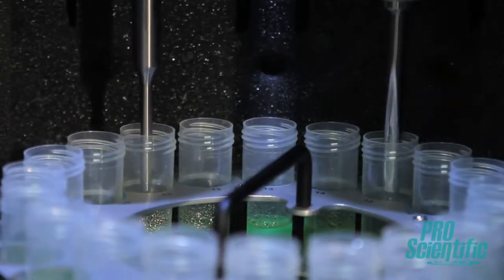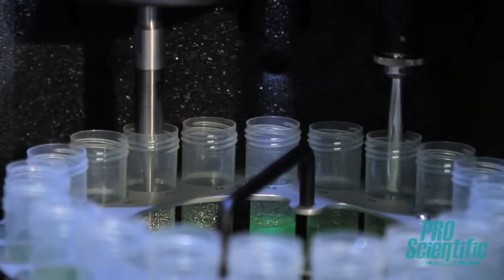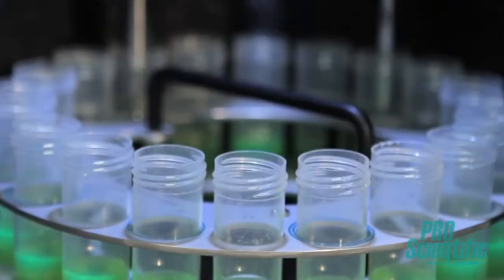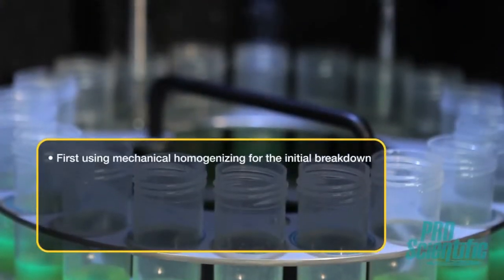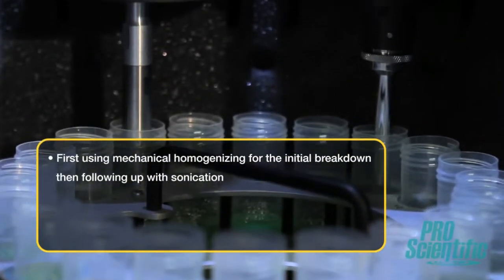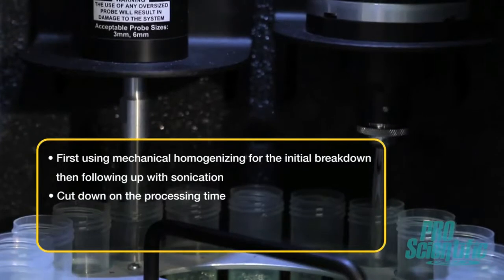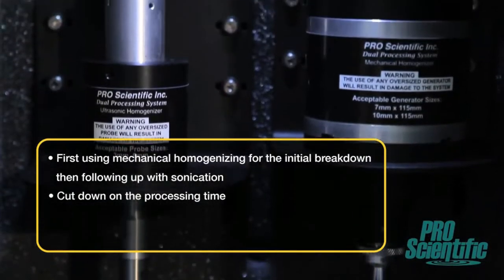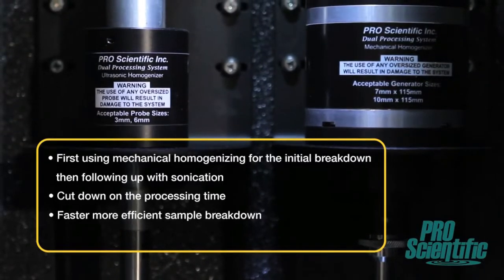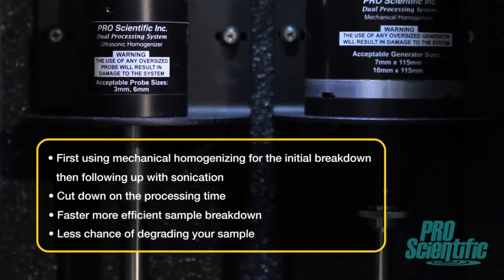The DPS20's Dual Processing Mode takes the benefits of each method and utilizes them together without any of the downsides. By first using mechanical homogenizing for the initial breakdown and then following up with sonication, you cut down on the processing time compared to having used either homogenizing method independently. This means faster, more efficient sample breakdown with less chance of degrading your sample.